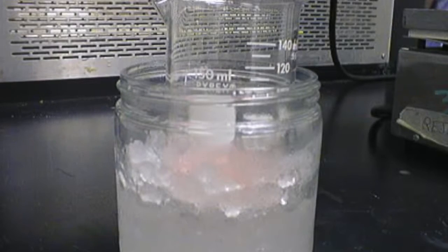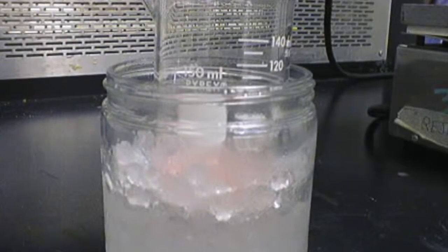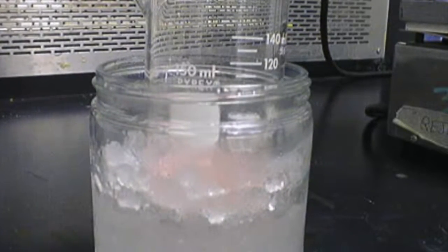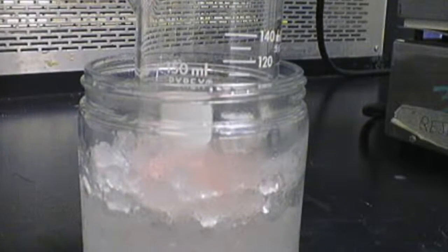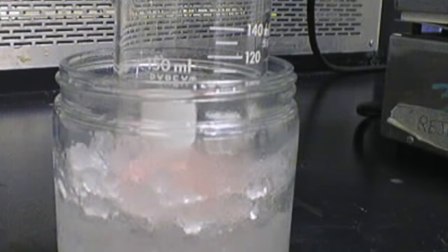After this, the once again clear colorless solution was submerged in an ice bath to cool its temperature. The decrease in temperature slowed the motions of the particles in the solution and decreased their kinetic energy, allowing intermolecular forces to dominate and the alum to crystallize.